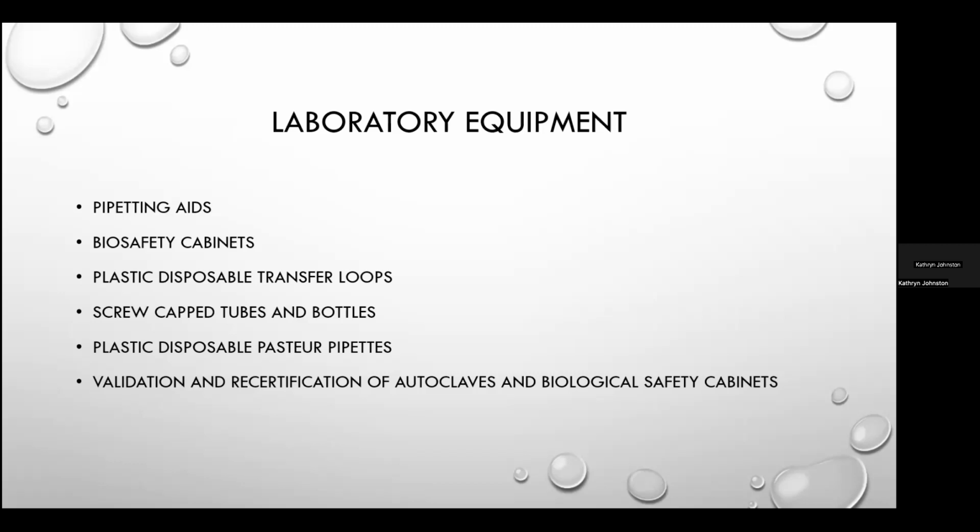You should use a biological safety cabinet if there's an increased risk of airborne infection. And as I stated earlier, if you process large numbers of specimens for tuberculosis, then you should have a biological safety cabinet for managing all respiratory specimens.